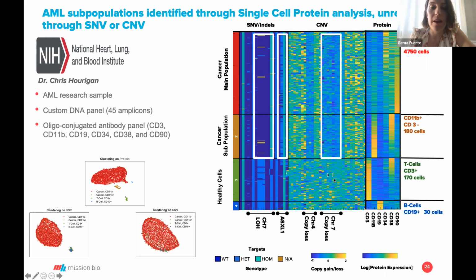When you go from copy number 2 to copy number 1, this mutation over here goes from heterozygous to homozygous. So there we have lost the wild type allele. Likewise, here, this mutation goes from heterozygous to wild type. So here, combined with the copy number loss, we have also lost the mutant allele. It is very exciting to see the genotype associated to the copy number in real time, something that you couldn't see with a copy number only assay. And that also is supporting information that this copy number is real because it has a genotype associated to it.